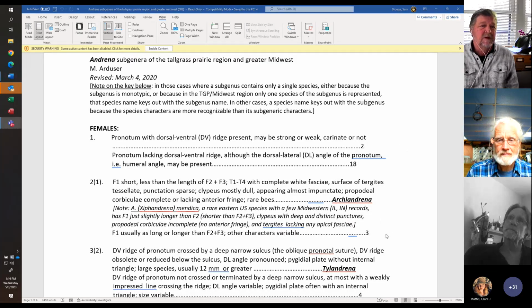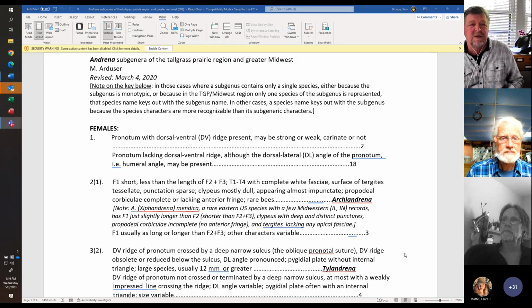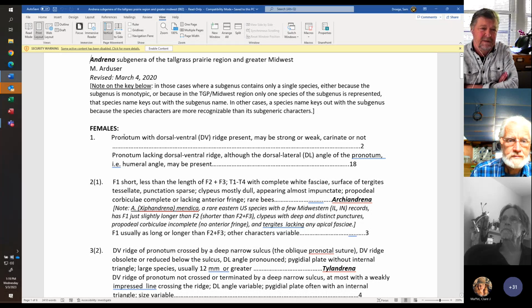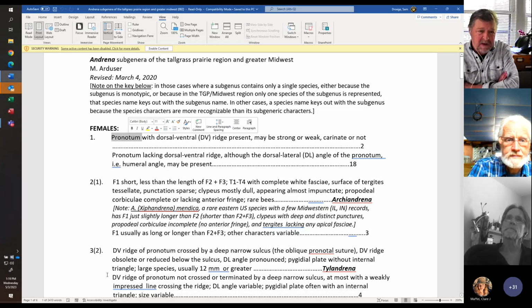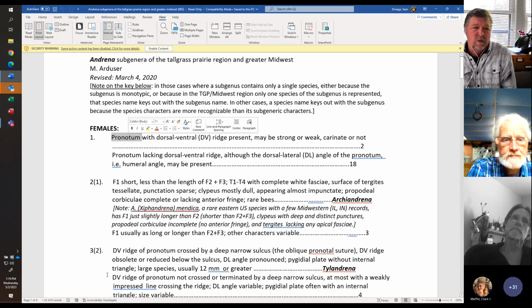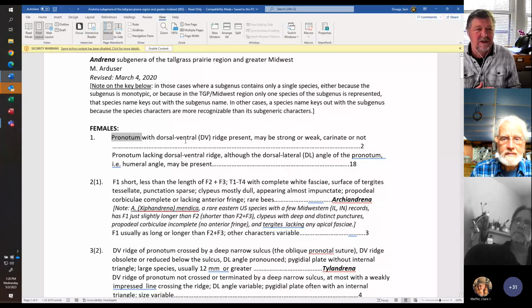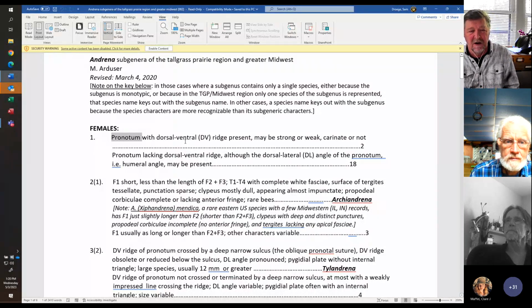All right, good. So David described the pronotum succinctly, and there's more than one feature of it that's important. There's what he called the humeral angle, that corner, so to speak, the back corner, and its shape, which can be very sharp, like a right angle, and then it can go all the way down to a nice, smooth, gentle curve.